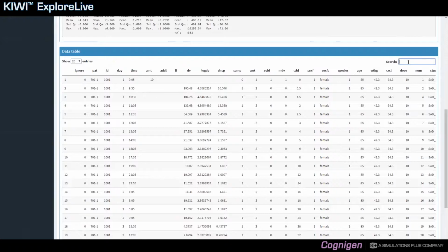So anything that is on the left of what you type and on the right will not be excluded. So if I type male, for example, female will still be recognized as a match for male.